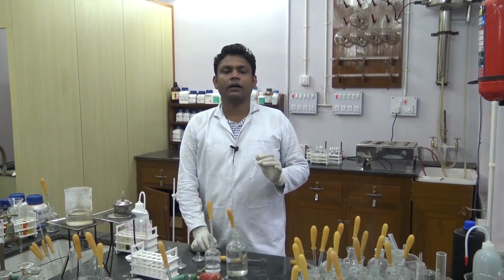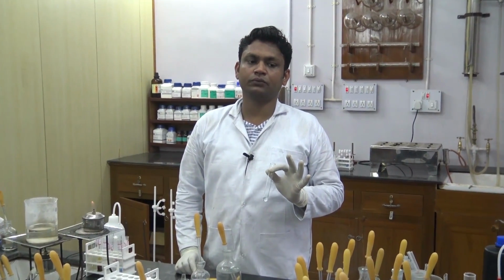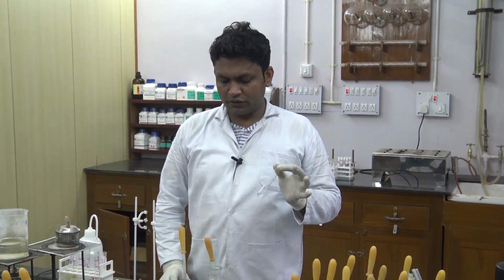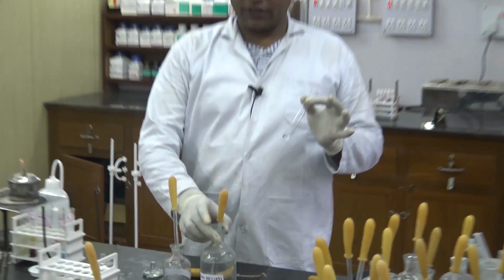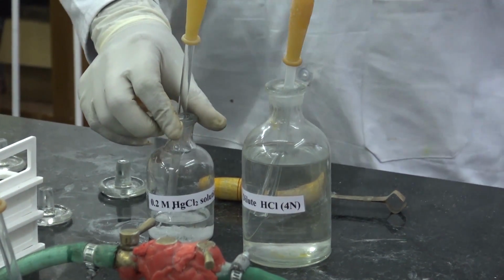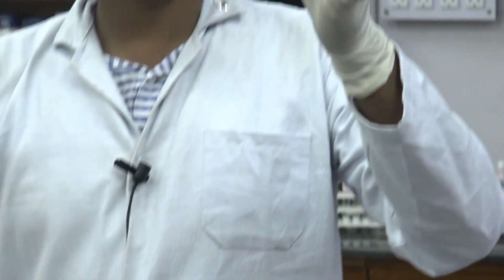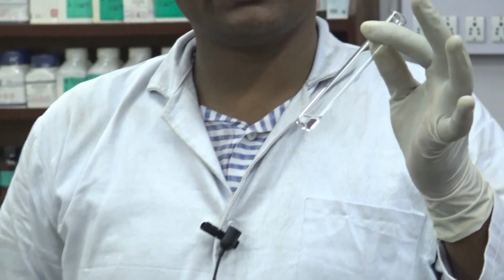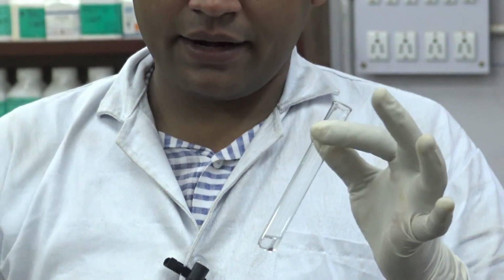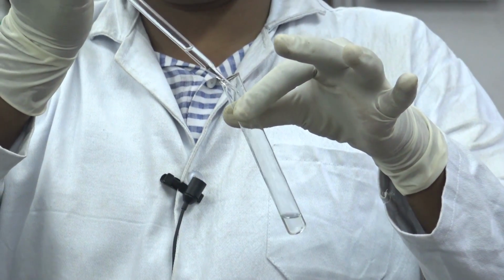Now we will perform the confirmatory test for stannous ion, that is Sn+2, which is mercuric chloride test. For this test we require dilute HCl and 0.2 molar mercuric chloride solution. Then to proceed for the reaction, at first take sample solution which contains Sn+2, then add few drops of HCl into it.